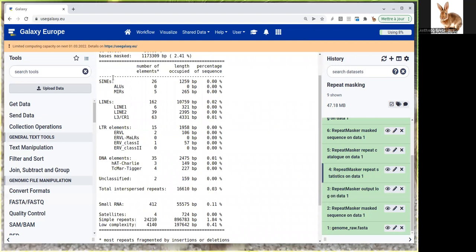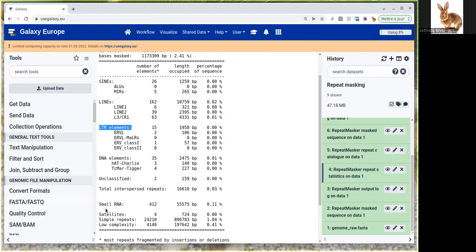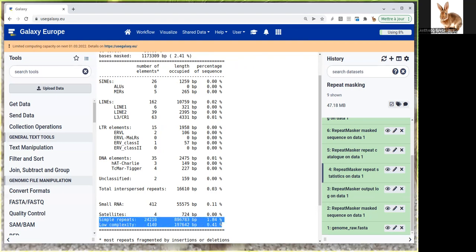If you look at this region in the statistics file, you'll find the classification of all the repeats found. You can have short elements, long elements, LTR elements, and other kinds. If you look at this classification on the internet or Wikipedia, you'll get more information. At the end, you get a lot of satellites, simple repeats, and low complexity regions. If you look at the percentage, they represent the vast majority of repeated elements detected. That's probably because we used the human entry from DFAM to perform repeat masking on this genome.